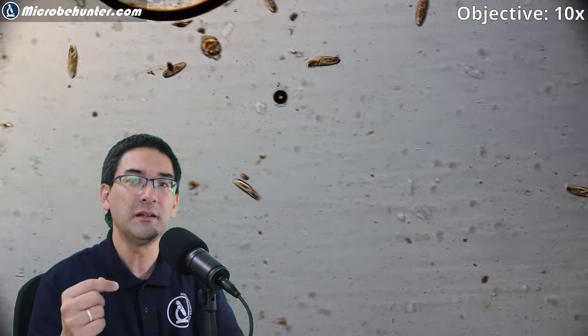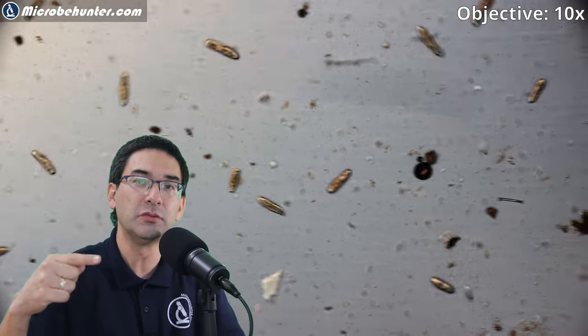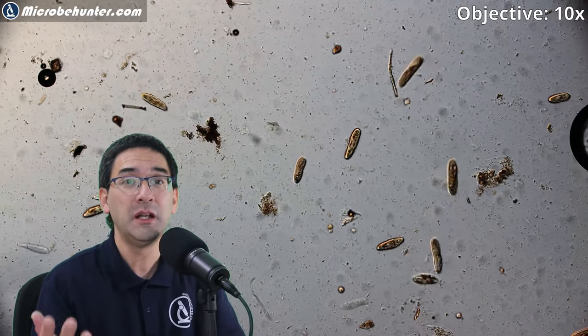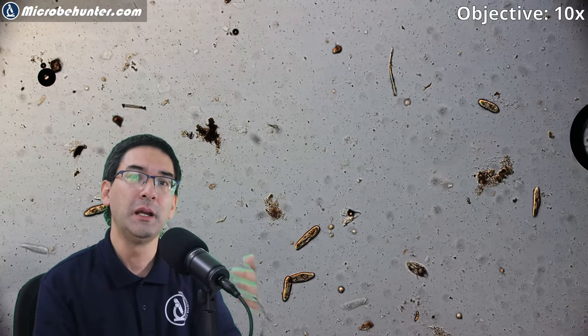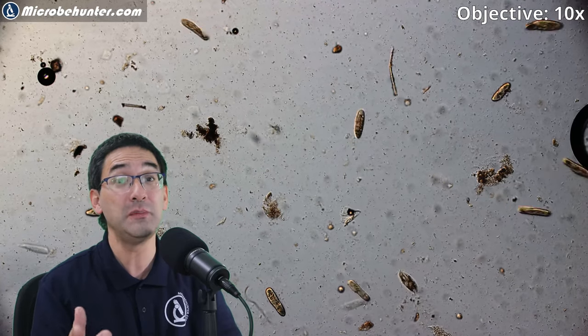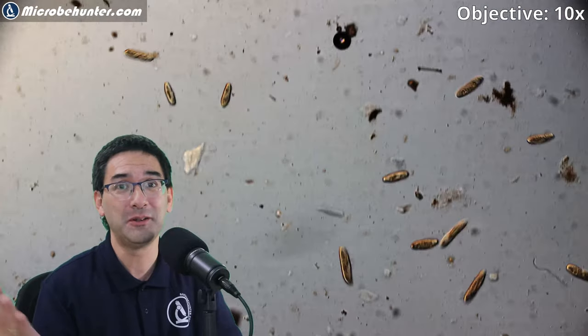At a slightly higher concentration, look what they're doing — they're starting to spin, actually rotating around one of their axes and moving in one direction. That's also quite interesting, something new I discovered. This only happens when the concentration is a little bit higher. But if you wait a bit longer, many of them actually start to die off and stop moving.